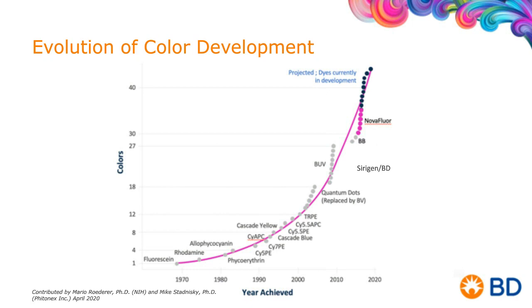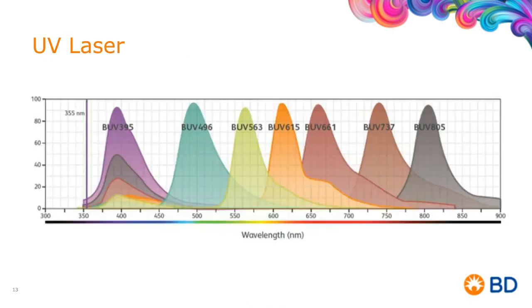If we take a step, though, and look at a laser line, there's a story that sometimes is overlooked, because for the most part, when we look at a laser line, we just look for all the colors, we can kind of see where they spill into each other, and we just move from there to our panel.